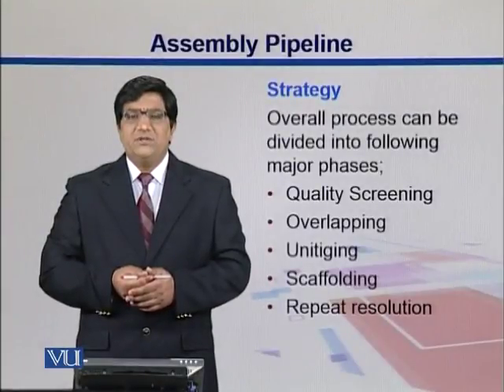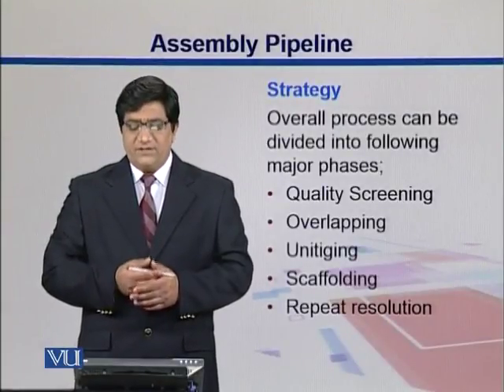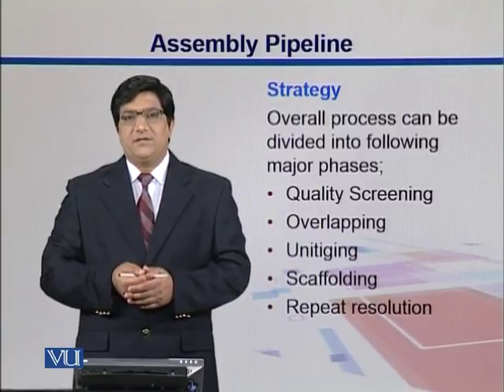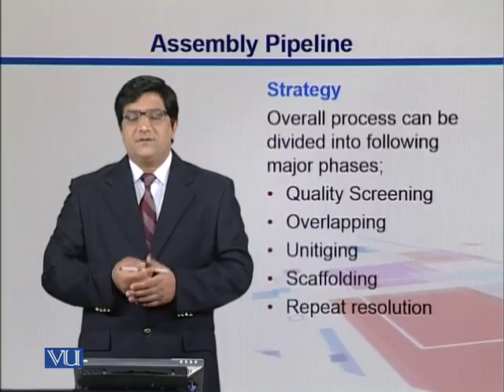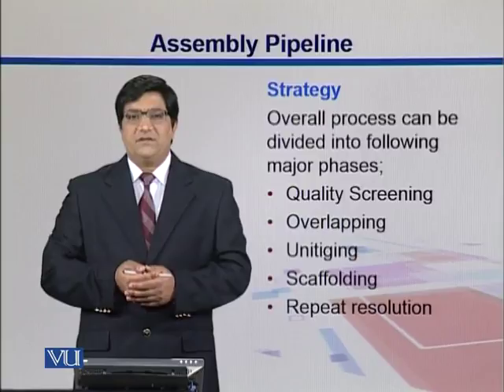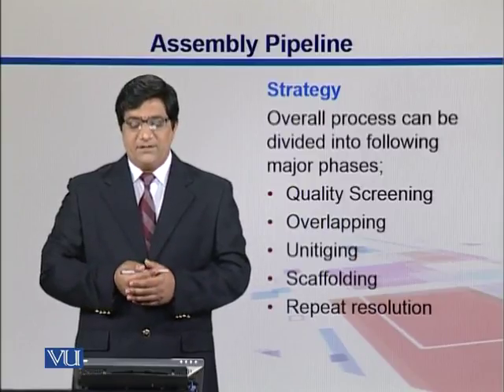So let's look into the pipeline for assembly. Now we are starting with those short reads. We are talking about libraries. We get those reads, and let's look into what we can do on computers. I define that as the assembly pipeline.